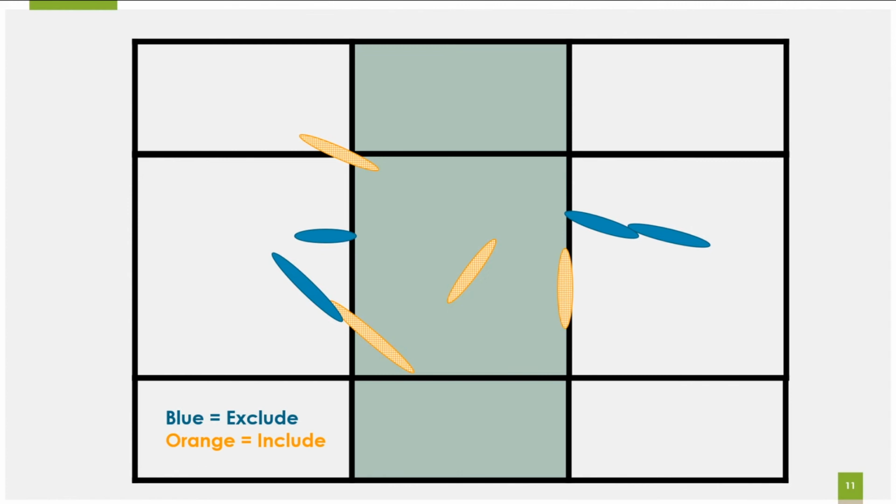But it also gave us a bunch of comparisons so that we would start to get a feel for, if Brooke says there's 700 cells per liter, how tight or fuzzy is that number? And now we have some quantitative measurements of how fuzzy these numbers are. So when you're counting, one of the things that we're going to talk about is if you choose to count the stuff we leave for you, Brooke has already counted it. You'll have access to her results. You'll get your own results, and then you can see how close or how far you are.